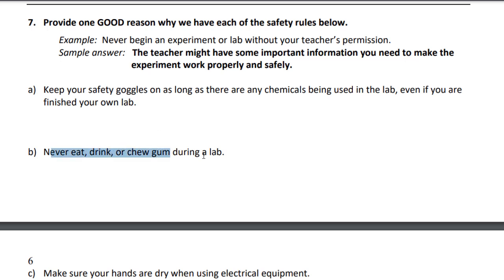Never eating, drinking, or chewing gum during the lab. What you're actually doing if you chew gum in a science lab is inviting those chemicals to stick to the gum because they'll be picked up in the air, and then you're literally pushing it against the skin of your mouth and against your tongue the entire time. So you're concentrating the chemicals that are there. Not a good plan. It's very easy to have the chemicals touch the food or touch your drink and then go into you. So that's why we don't want to do that.